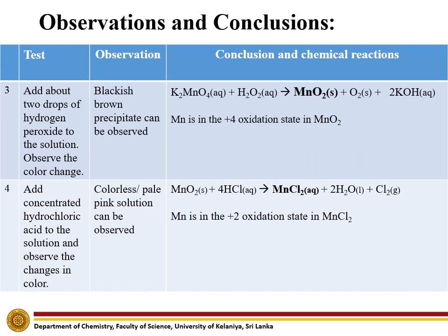Finally, with the addition of concentrated hydrochloric acid to this precipitate, a reduction in Manganese takes place from the +4 to the +2 oxidation state, giving a colorless solution. So this colorless manganese chloride solution represents the +2 oxidation state of Manganese.